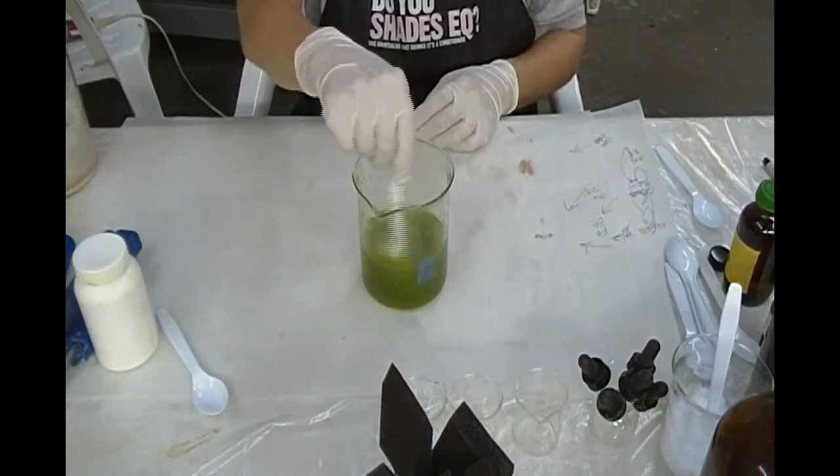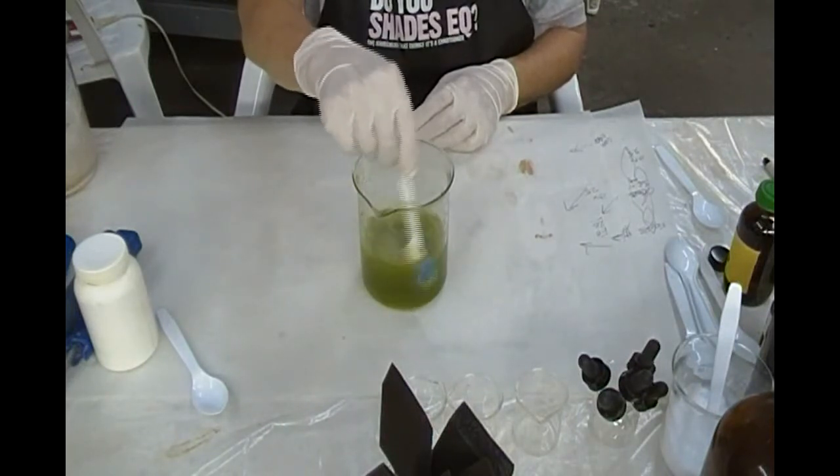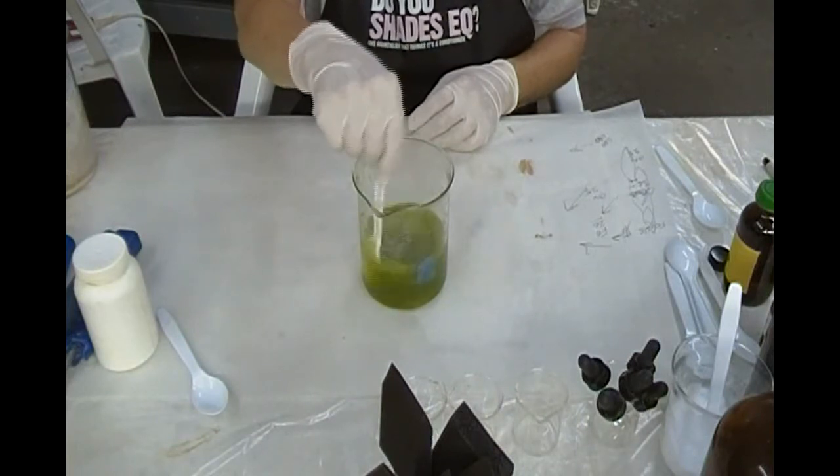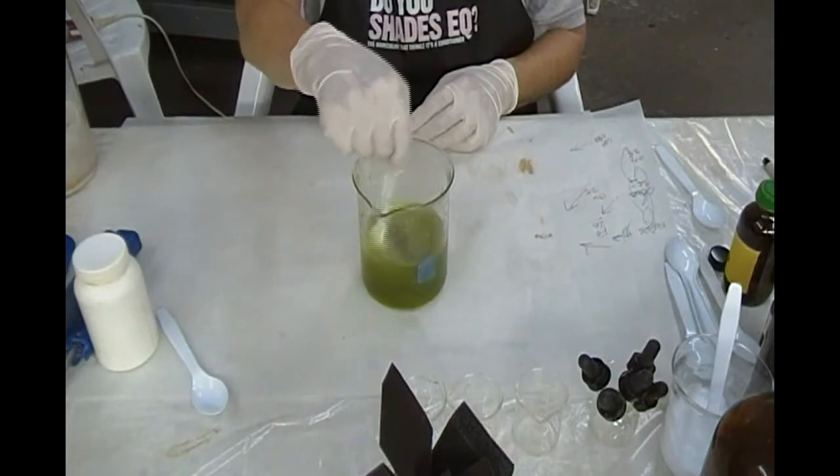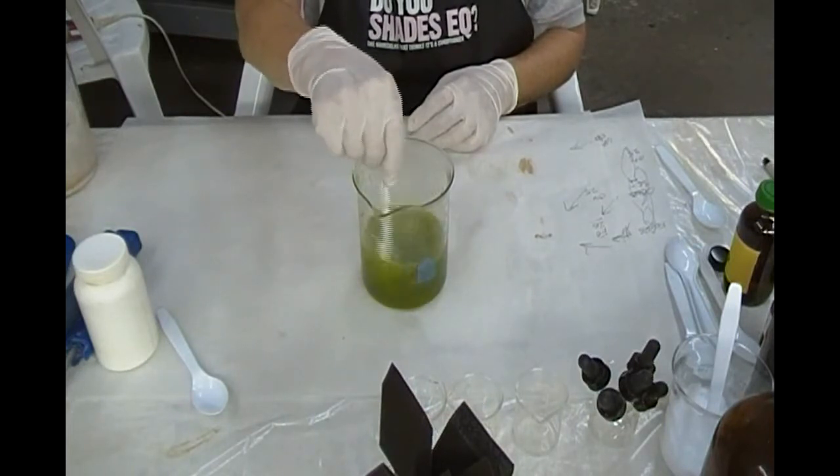As you notice here, what Madeline is doing is that the ferric oxalate, because of the oxalic acid and the guanidine carbonate, is starting to become clear.